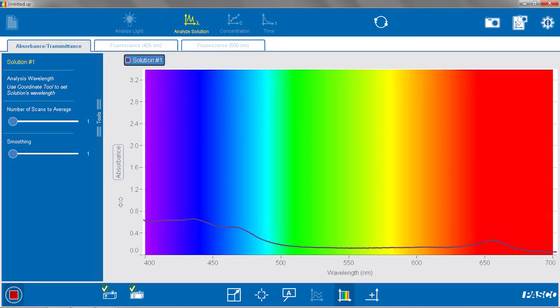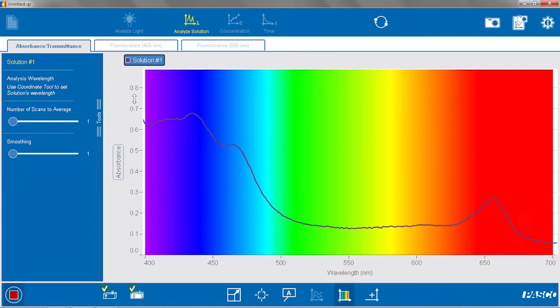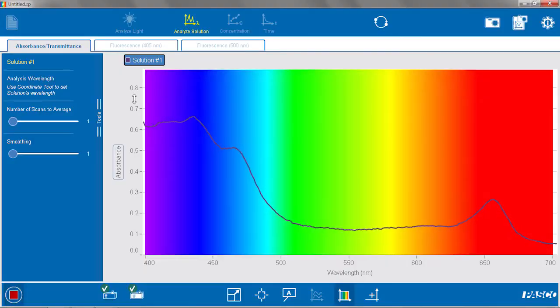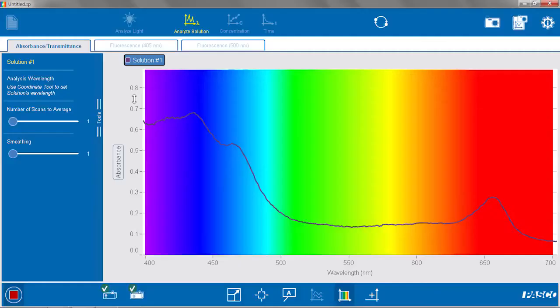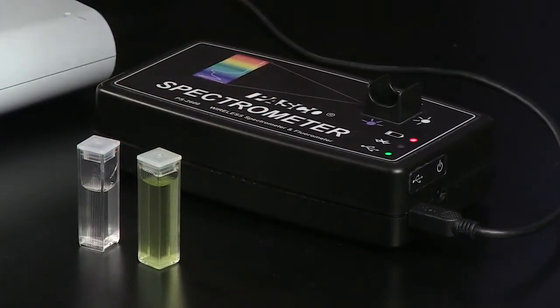You can see a higher absorbance of the blue light and the red light. I can get a better view of this data by clicking and dragging on the axes. Biology teachers definitely wouldn't be too surprised at this result — the peaks are in the blue and red wavelength ranges. But this is really cool for students, because typically they only get this view of data from a picture in their textbook. For them to extract pigments from real leaves, put it into a spectrometer, and get the absorbance spectrum themselves is a really meaningful activity. And it's easy to compare different leaves — easy to send students into inquiry following the spinach procedure. They can bring in all different kinds of leaves, extract the pigments, and easily compare different kinds of leaves to each other.